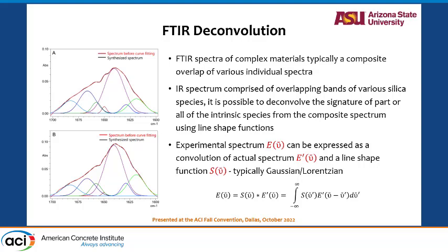There is something called line broadening for all these spectra, and that is very similar to the idea that there is an uncertainty in the energy that you predict or measure, and there is an uncertainty in the lifetime of that vibration because of that energy. So it is very similar to Heisenberg's uncertainty principle, and this is related to Planck's constant. So you can have this lifetime broadening. Depending on what the state of energy is, you will get broad or narrow curves, and you just have no idea what kind of bond characteristics are possible.